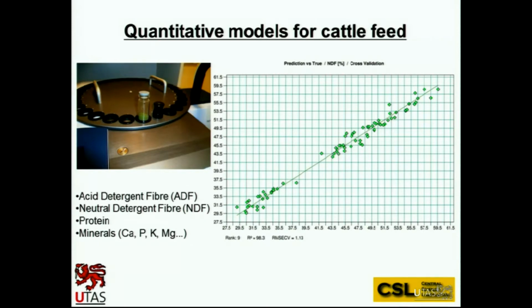So good data into the model means you get usually good models out. So a very powerful tool. And what it means now is simply you get this sort of glass vial. You've got an auto-sampler, and within seconds you get all the answers in one hit. Very cheap, very effective, very fast analysis. But you do have to go and create these initial models first.